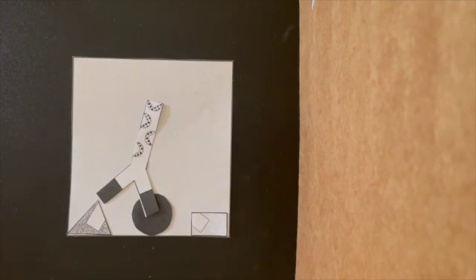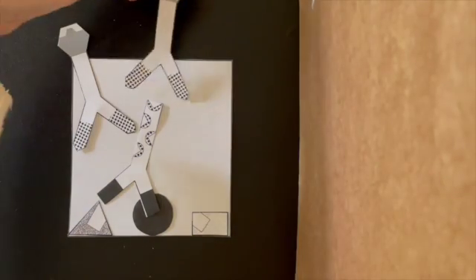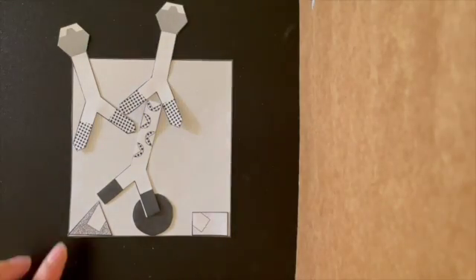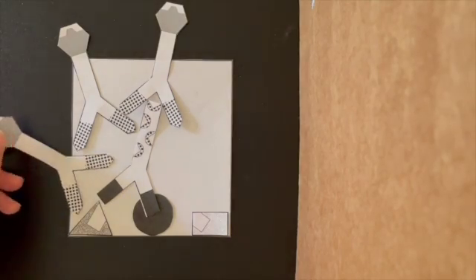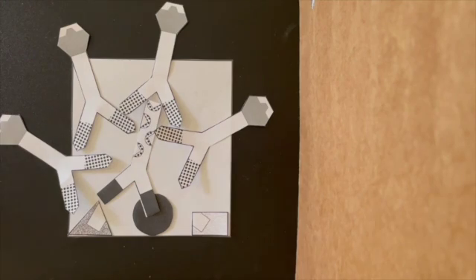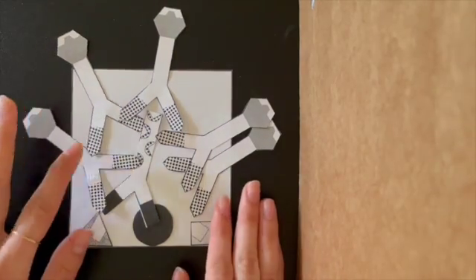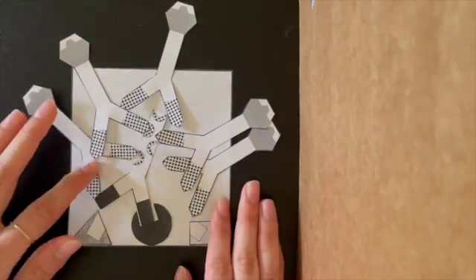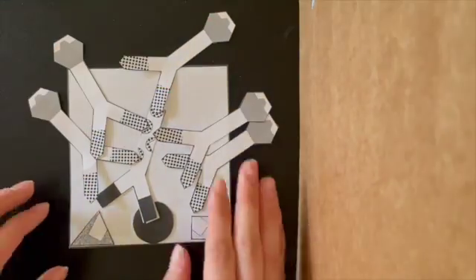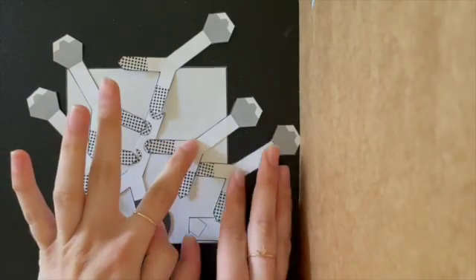Once the primary antibody successfully binds its target antigen, enzyme-linked secondary antibodies are added to bind to regions on the primary antibody. The process of incubation and adding a wash buffer to the well is repeated additional times to remove unbound secondary antibodies.